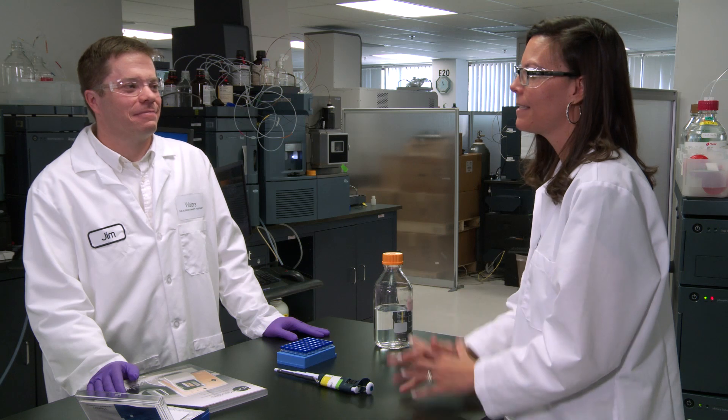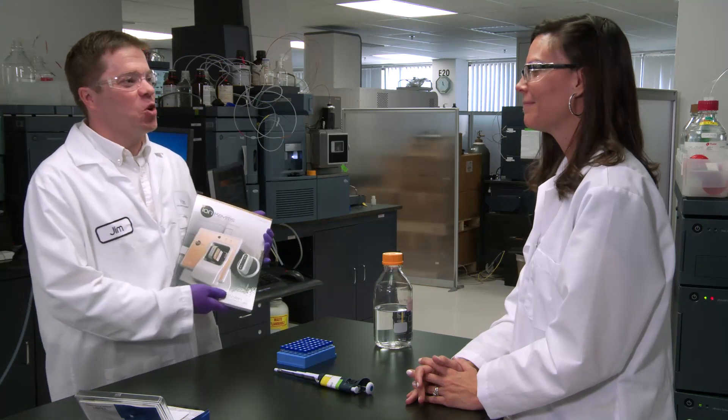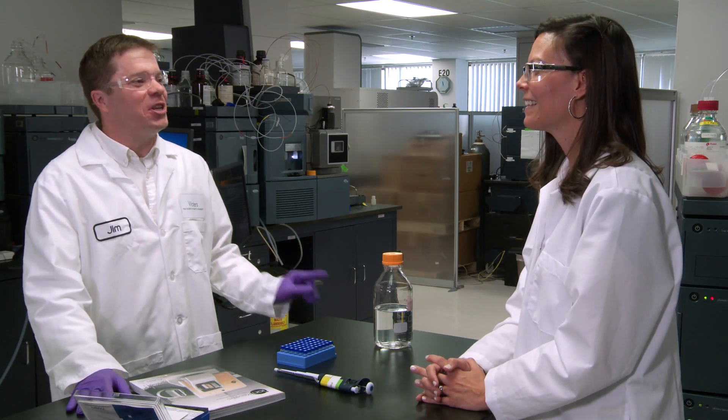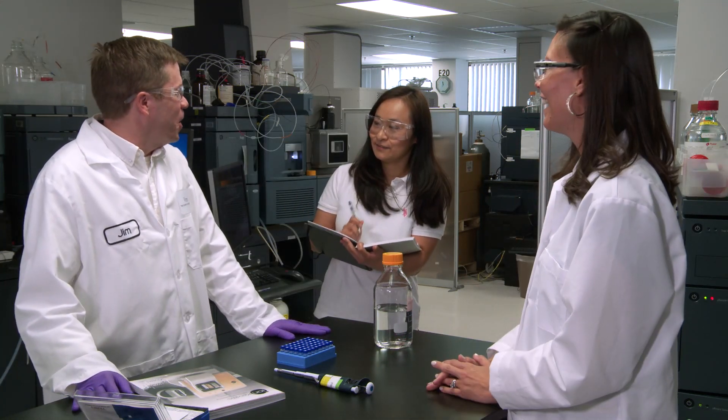Jim, you've sold me on the sensitivity. However, I'm still a little apprehensive about the complexity of this technique. What if I can't find you and have questions? That's a good question. Waters has two great resources: we have our application notebook that has a lot of information about applications ranging from pharma to food safety, and Patty, our product manager, just started a really informational blog on our Waters website. What did I get here? Oh, you're everywhere!